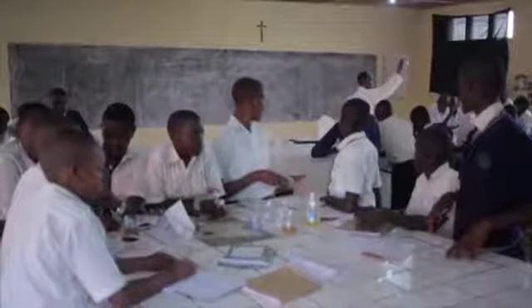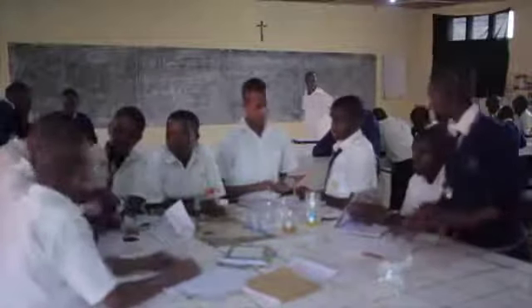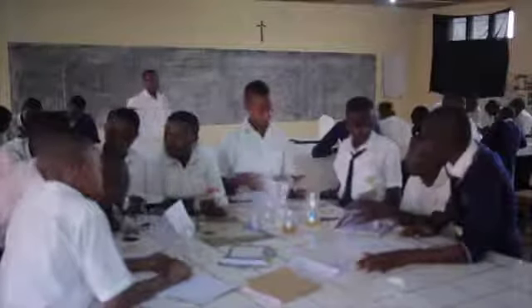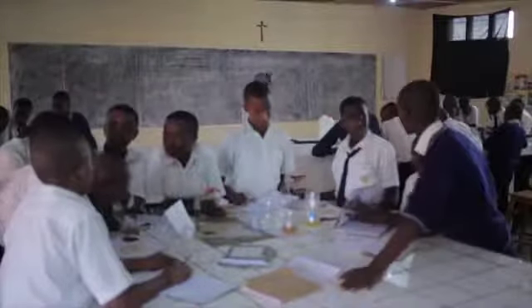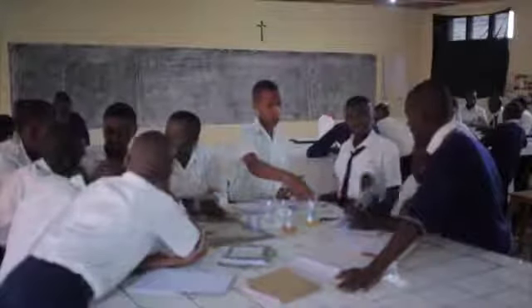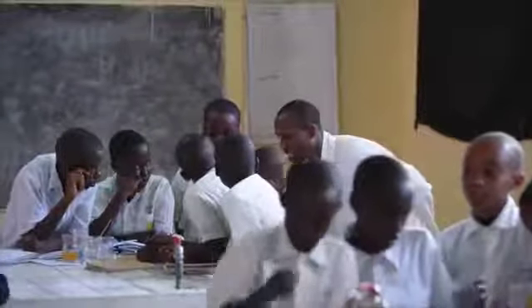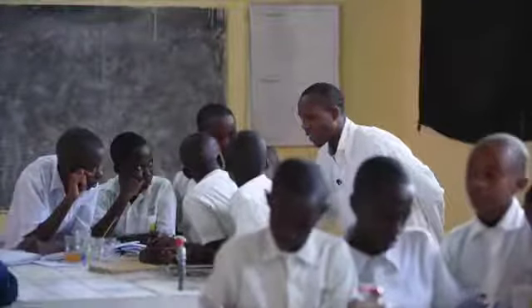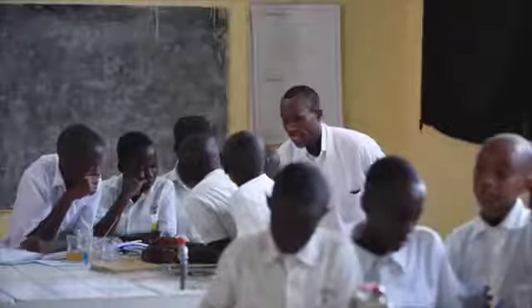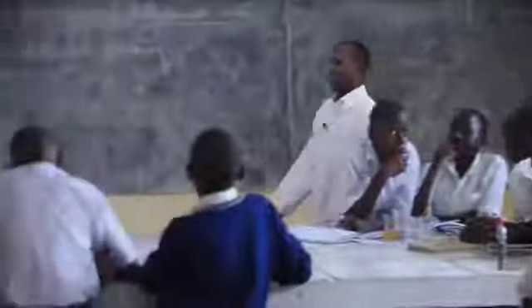Write down the name of this instrument. The method is decantation, then the instrument is... okay. Very nice.